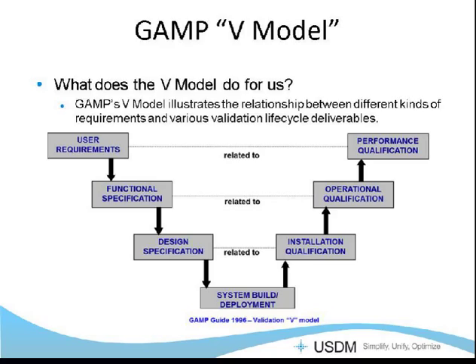The FDA knows it. So when something happens and you have an audit, if you follow a standard methodology, the FDA understands that methodology and they know what they're looking for. If they have to figure out your methodology, you've just invited them to sit with you for a bit longer.